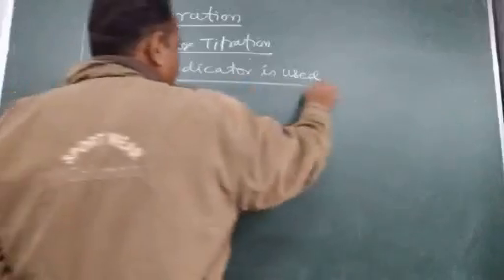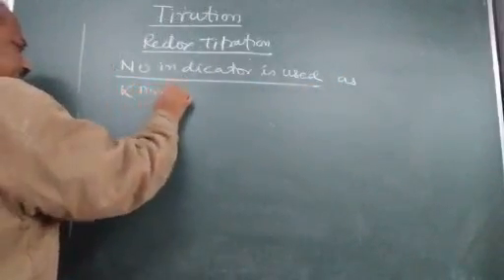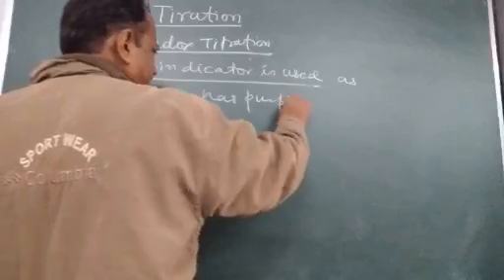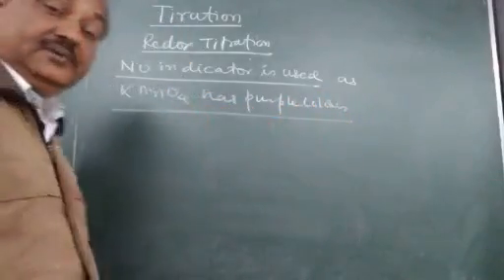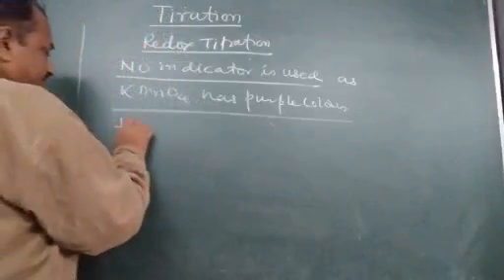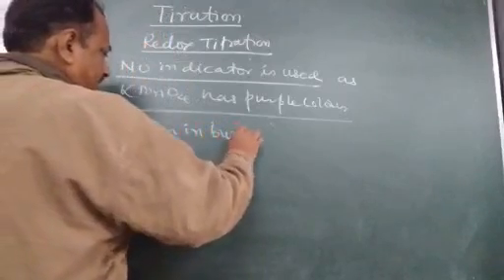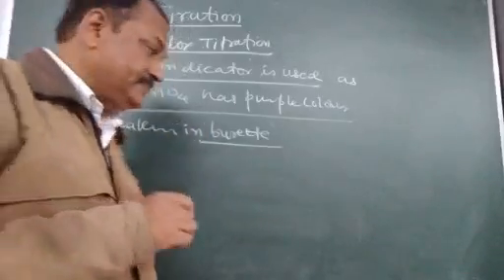No indicator is used, as KMnO4 has a purple color, and KMnO4 is taken in the burette.